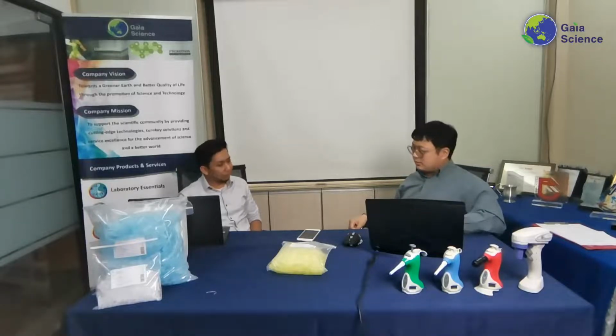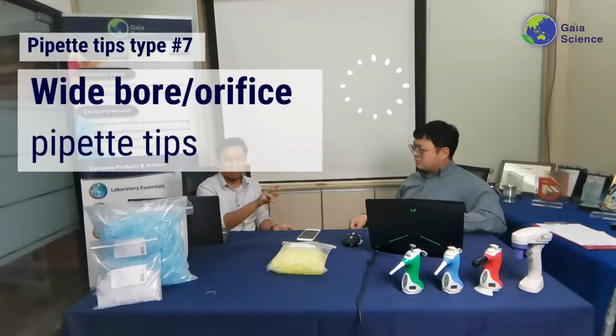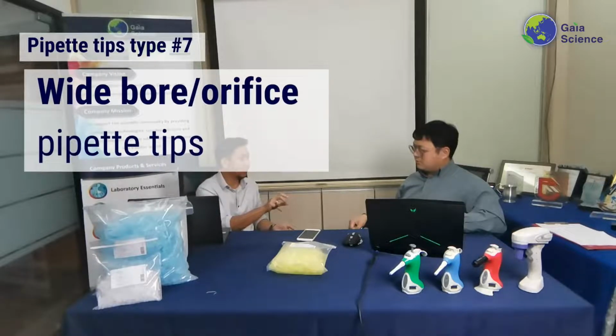There are a few more types of pipette tips: bulk and rack, and comparing filtered, non-filtered, sterile, non-sterile. There are also some odd cases where they sometimes have wide bore or orifice tips. What is that actually?